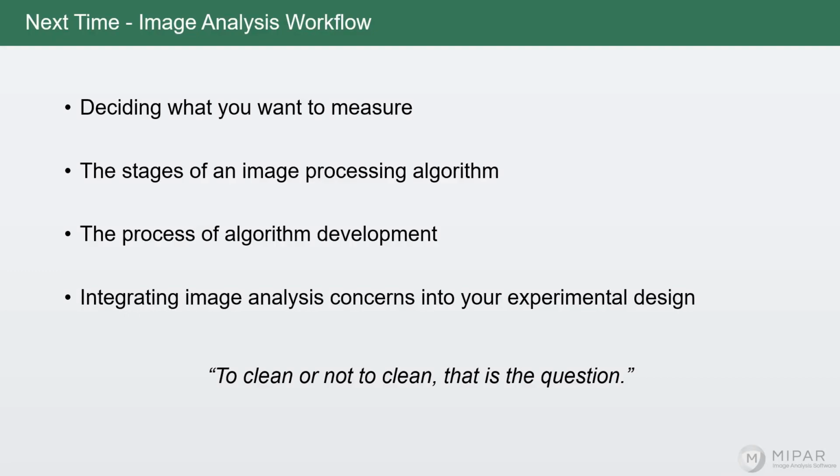Next time, we'll talk about the image analysis workflow. How do you decide what data you actually want to extract from your image? What might an image processing algorithm look like that's designed to extract that particular data, and how would you go about actually developing that algorithm? We'll also touch on how some image analysis concerns can influence your experimental design.